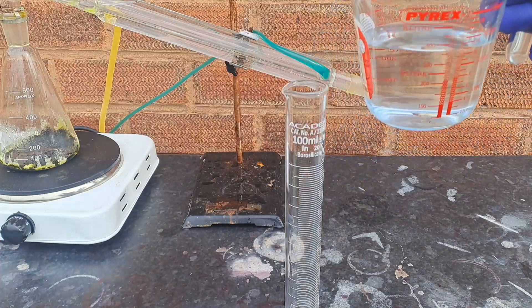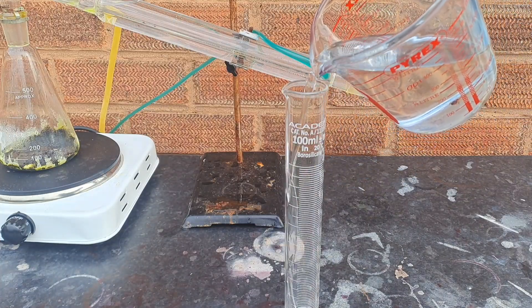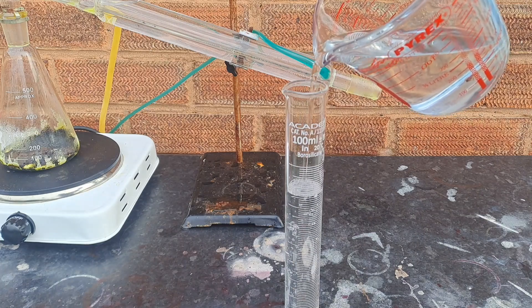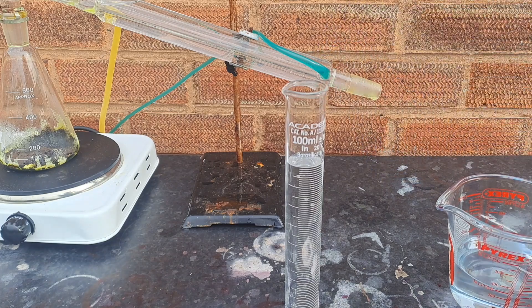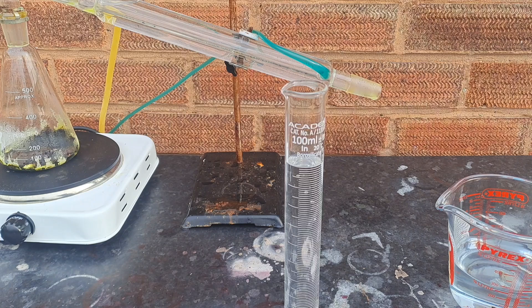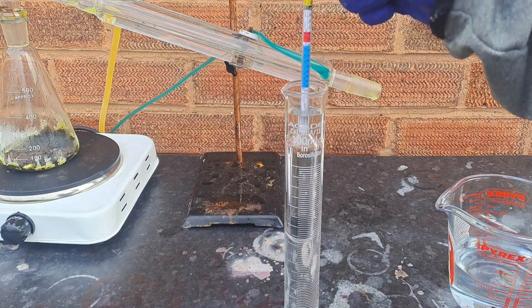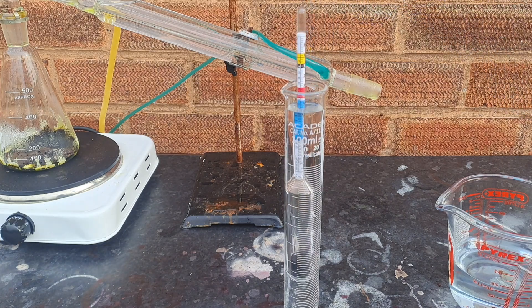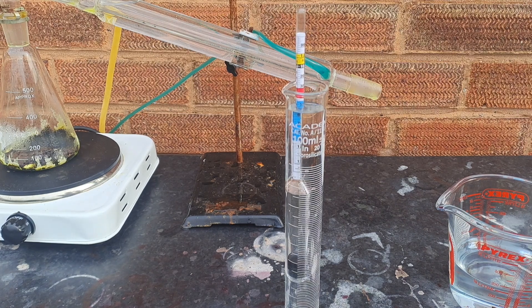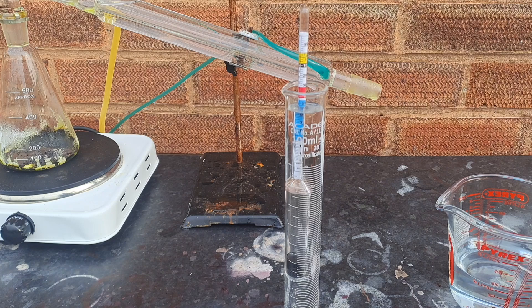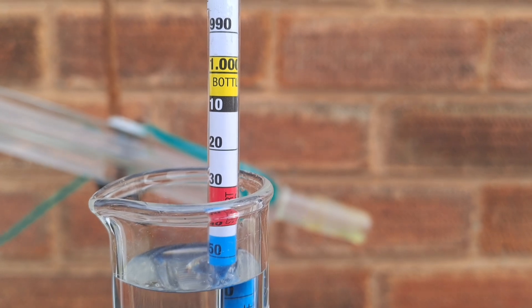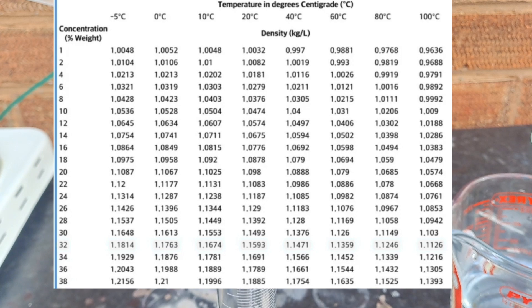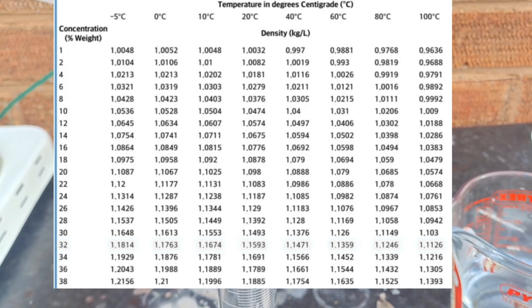To test the acid's strength, I will be measuring its specific gravity. When testing the specific gravity of hydrochloric acid, a hydrometer is used to determine the concentration of HCl in the solution. The process follows Archimedes' principle, where the hydrometer floats higher in a denser, more concentrated acid, and lower in a less dense, diluted acid. Pour a sufficient amount of HCl solution into a clear graduated cylinder. Carefully place the hydrometer into the acid and allow it to float freely, avoiding contact with the cylinder's sides. Observe where the liquid surface meets the hydrometer scale — this gives you the specific gravity of the acid. You can then compare the reading with known values using a chart. The specific gravity of this acid is around 1.0525, which means the acid recovered in the distillation is around 11%.